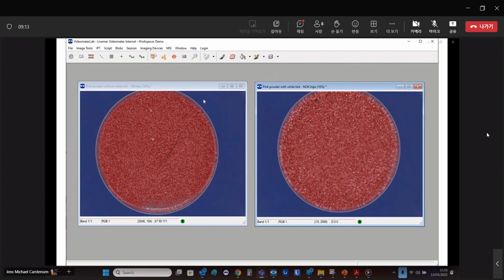In this application, we want to measure the color of a powder presented in a petri dish. So you put a certain amount in each petri dish and vibrate the dish so as to distribute the powders evenly on the dish. And then you can measure the powder within the dish, and typically you may have some unevenness of the powder distribution around the edge. So we would typically measure within a margin of 5 millimeters from the outer edge of the petri dish.